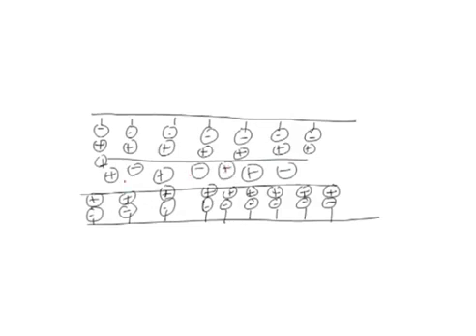Now, the negatively charged groups align here, and when the voltage is applied, the positively charged ions will move towards the cathode, the negatively charged electrode. Those attached near the wall also move towards the cathode. Essentially, positively charged ions should move towards the negatively charged electrode, and negatively charged ions should move towards the positively charged electrode. But because of the formation of the double layer and their interactions, the whole electrolytic flow occurs towards the cathode, and this flow carries everything with it.